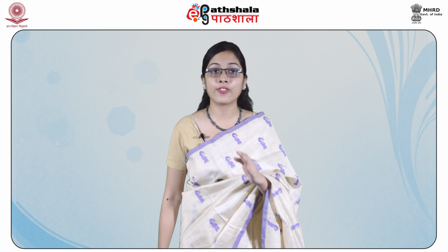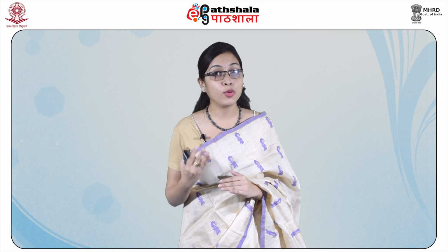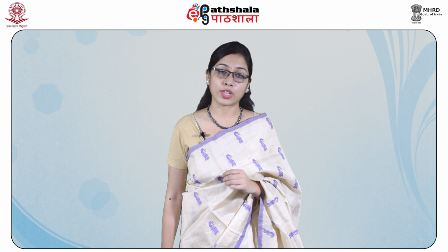The components of the plant pigment mixture separated into different colored bands in the column. Tswett coined the name chromatography from the Greek word chroma meaning color and graph meaning writing. Two British researchers, Martin and Synge, years later amended Tswett's chromatographic technique and devised a technique known as paper chromatography. They were able to use this technique to separate the amino acids in protein hydrolysate and were awarded the Nobel Prize in 1952 for their work.